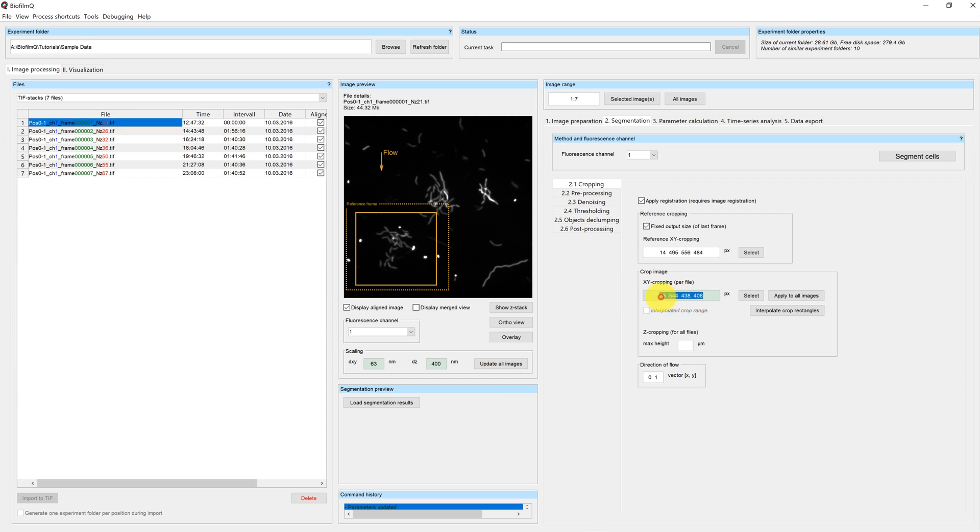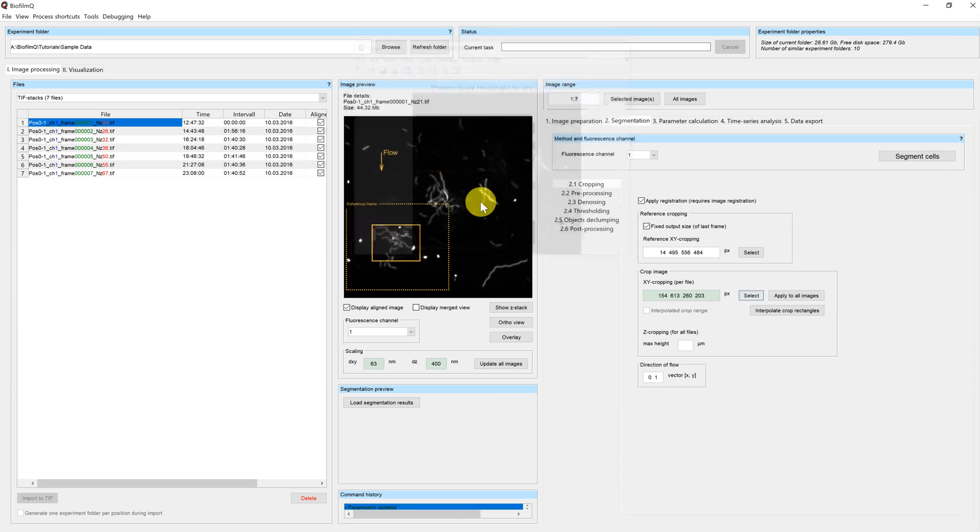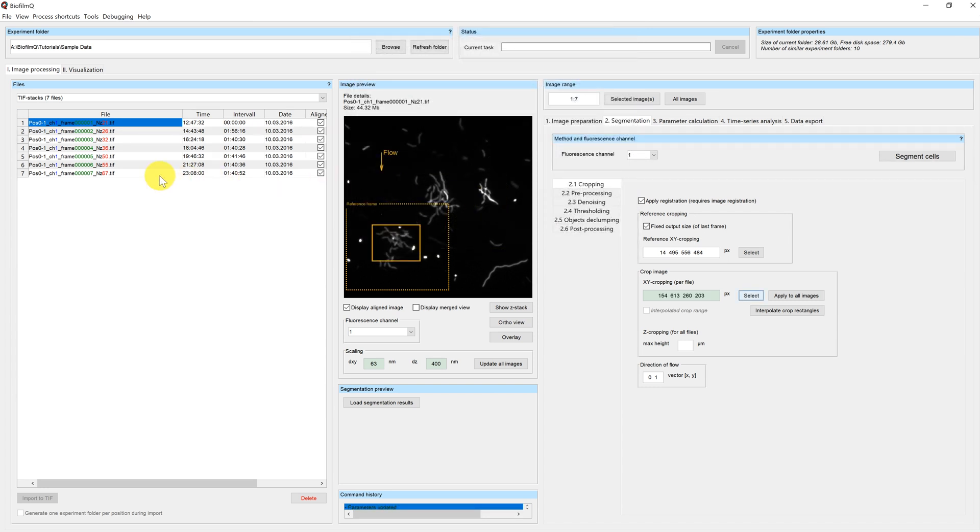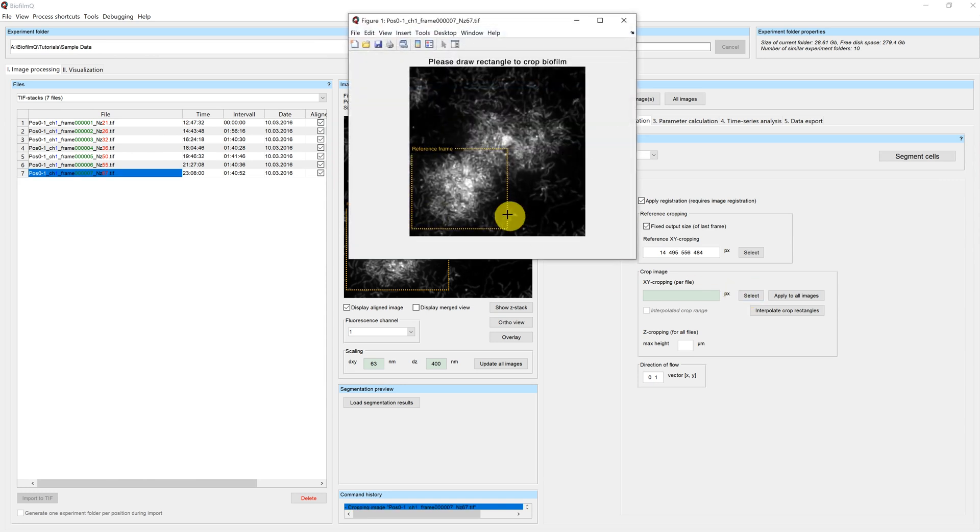First we have to delete our values again. We just delete the values and click on apply to all images. Now you can click on select again. Select the biofilm in your first image. And select the biofilm in your last image.